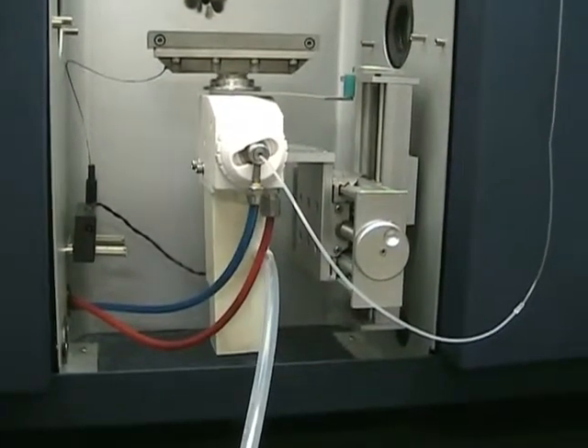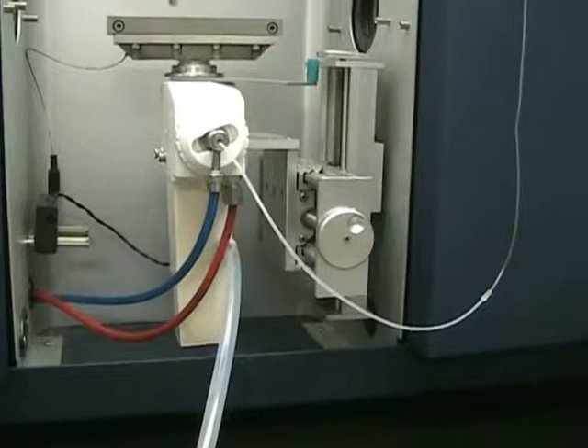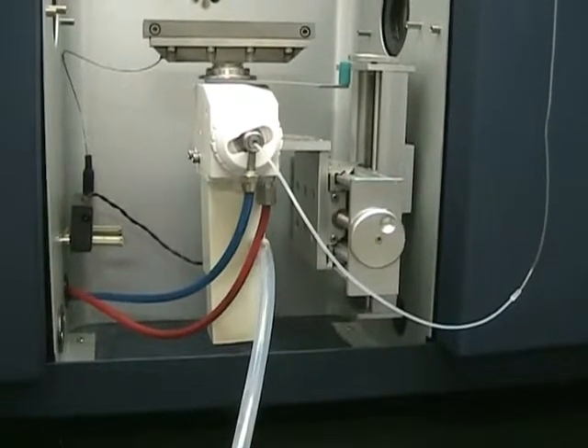So you have two nebulizers. I'm not sure how well the old one works — this new one is a $900 option consumable from Aurora.